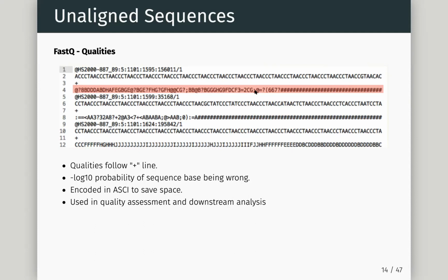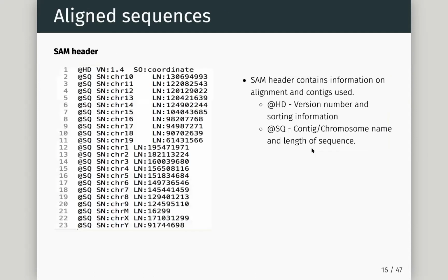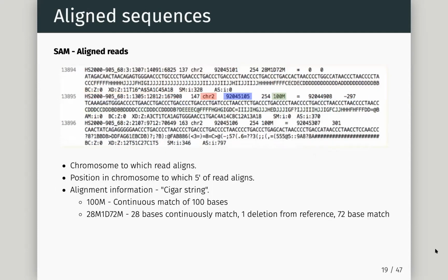Later on in the course, we're going to come back to Fastq and qualities. Connie's going to come and talk through how the Illumina sequencer works. To be fair, you'll rarely see anything before Fastq, so base calling won't really worry you. The major thing is when you start to get low qualities, you're either going to have to trim, or your aligner is going to have to take care of this for you. It's going to say low quality reads, I don't trust so much, so I'm not going to weight them so well in the alignment. That's a brief explanation of that, but we'll come back.